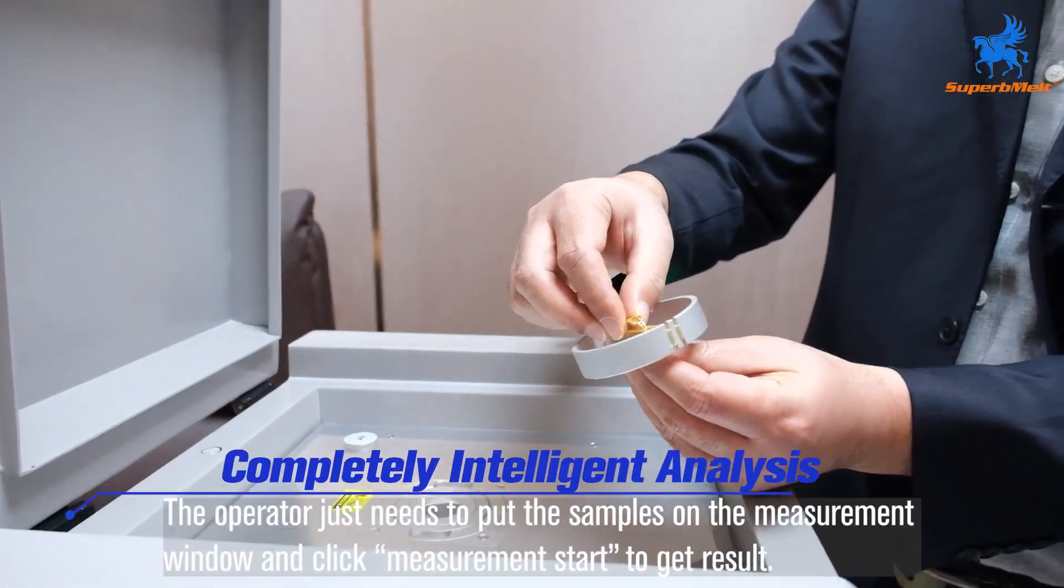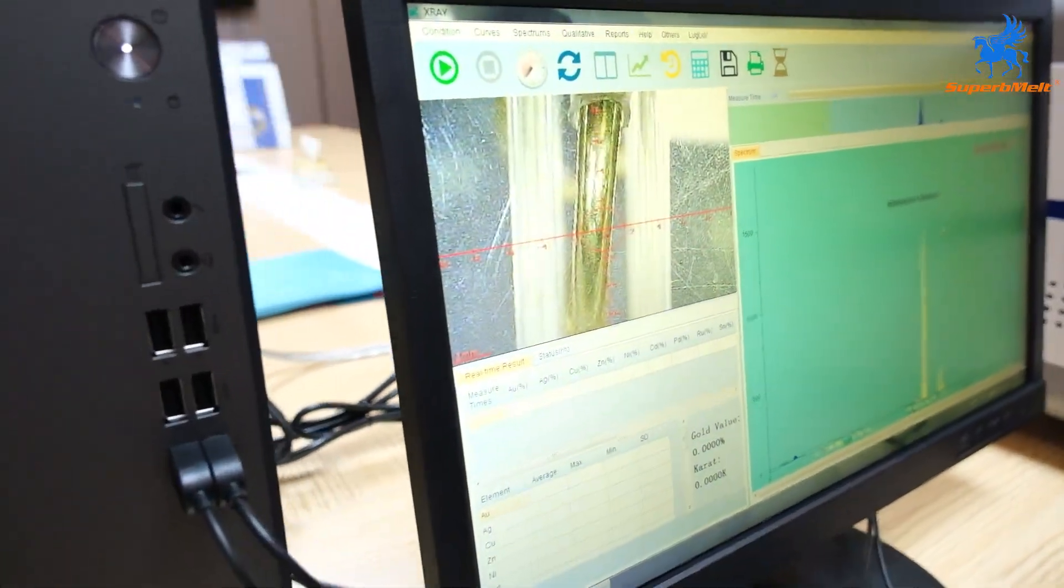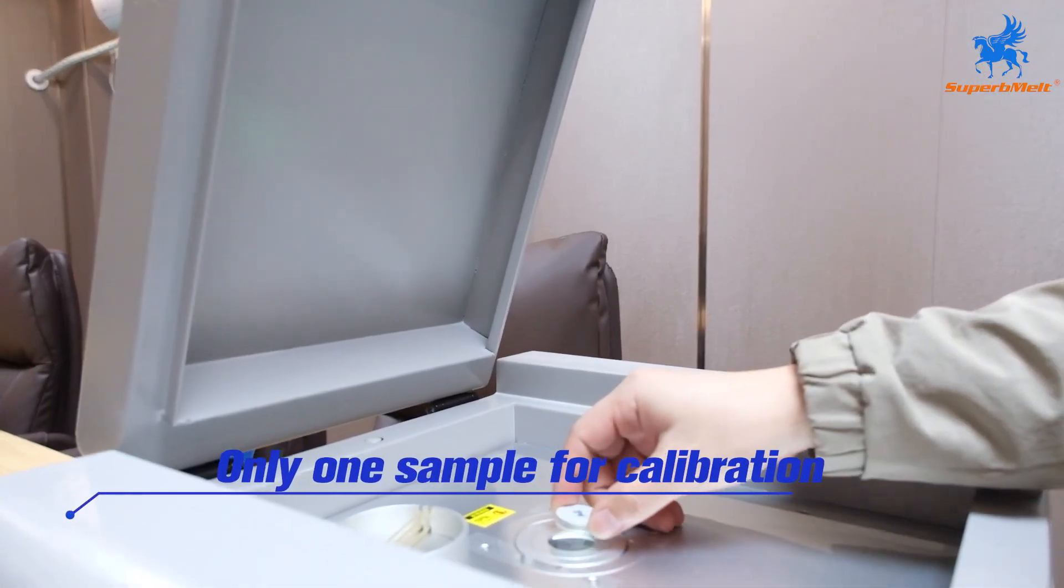The operator just needs to put the samples on the measurement window and click measurement start to get result. Only one sample for calibration.